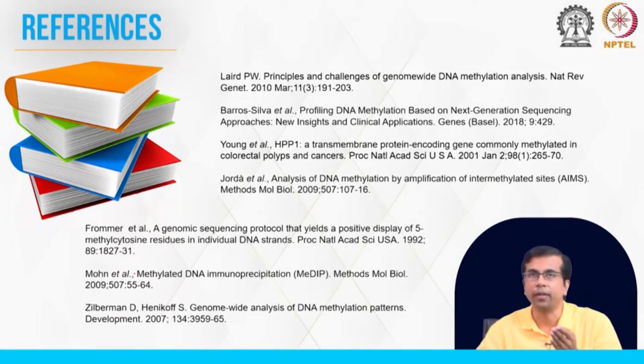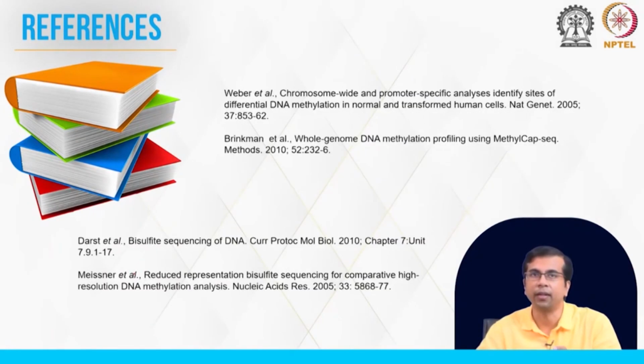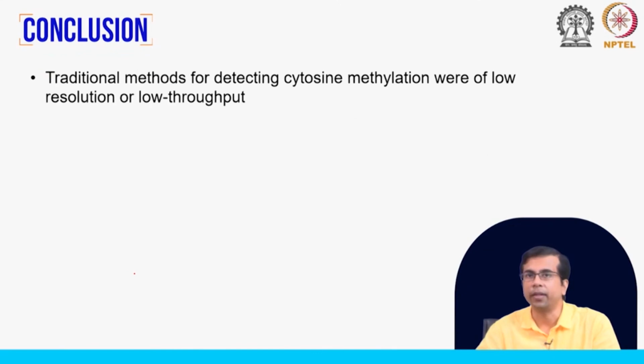Here are the references for this class, and to summarize, we talked about traditional methods for detecting cytosine methylation: PCR based, affinity based, and restriction digestion based detection methods.